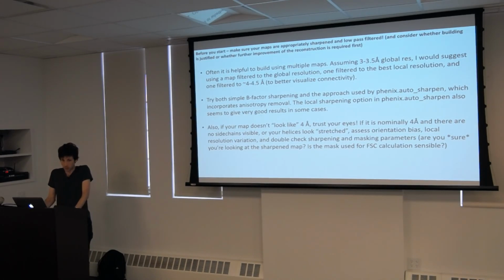And I personally like to build with multiple maps. So let's say you've got a structure in the resolution range of 3.5 angstroms or thereabouts.